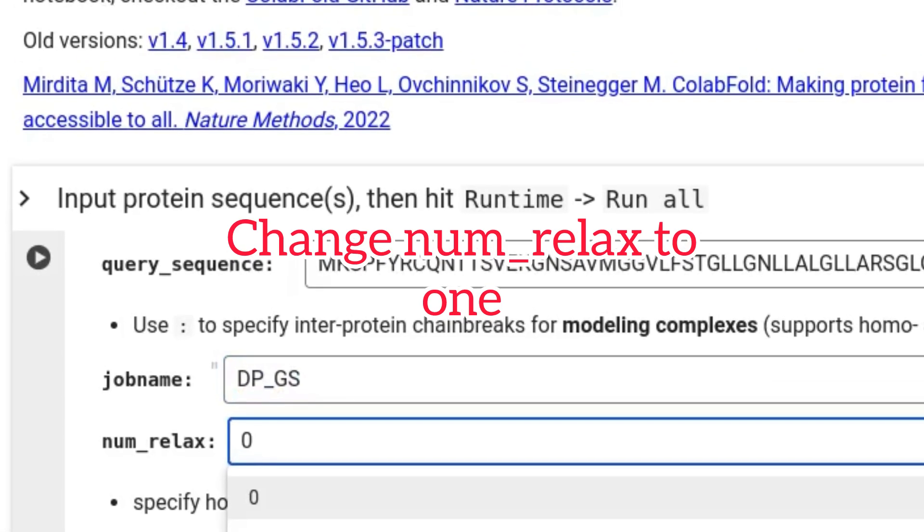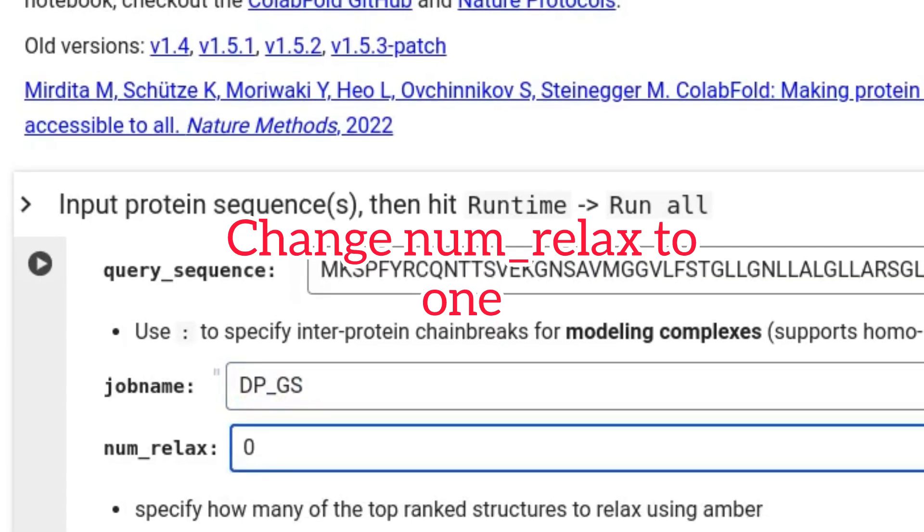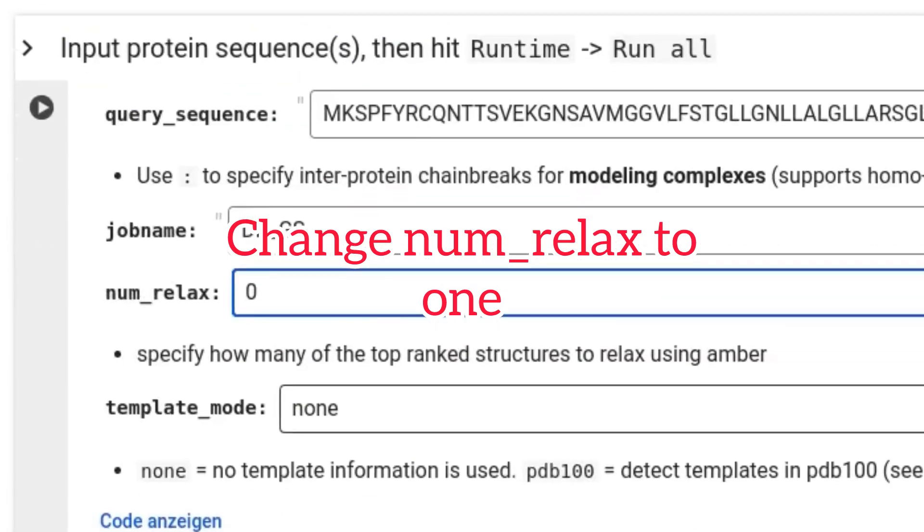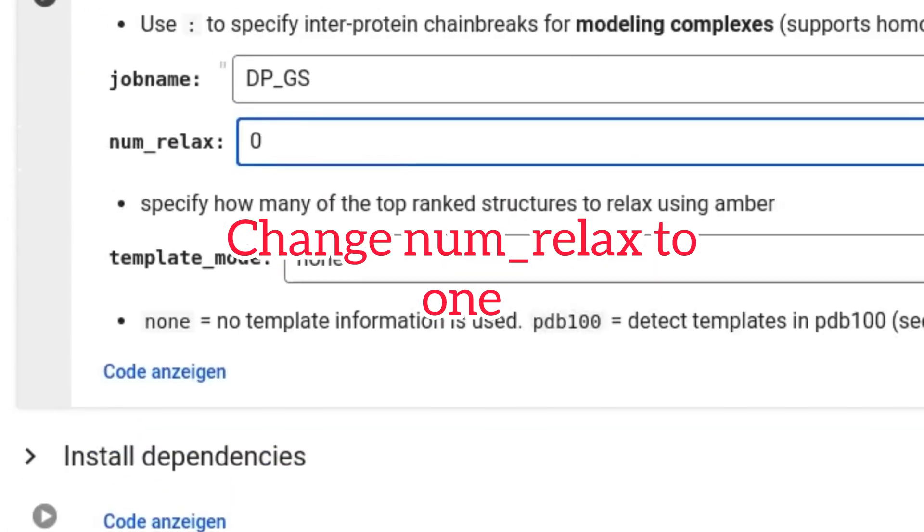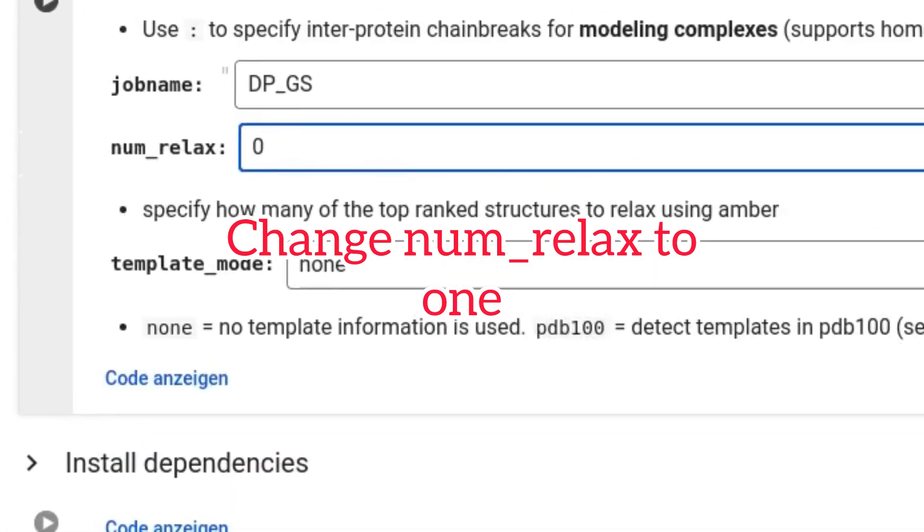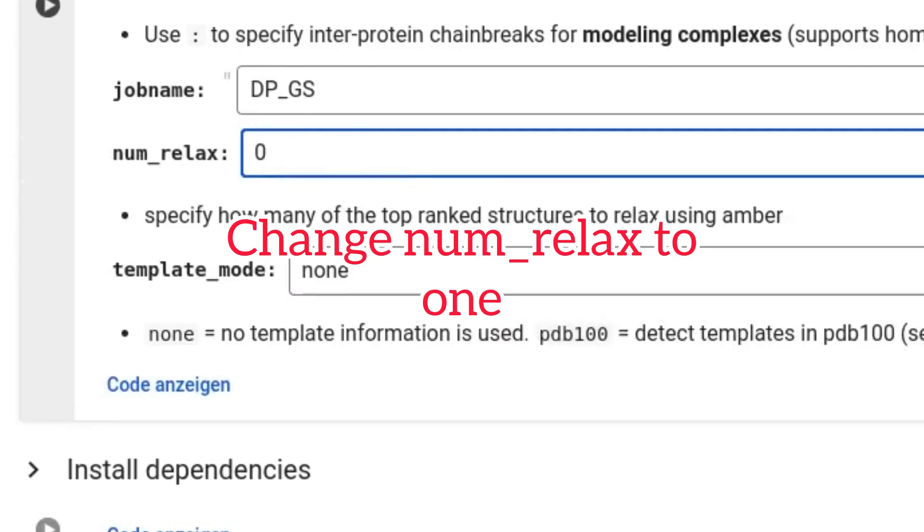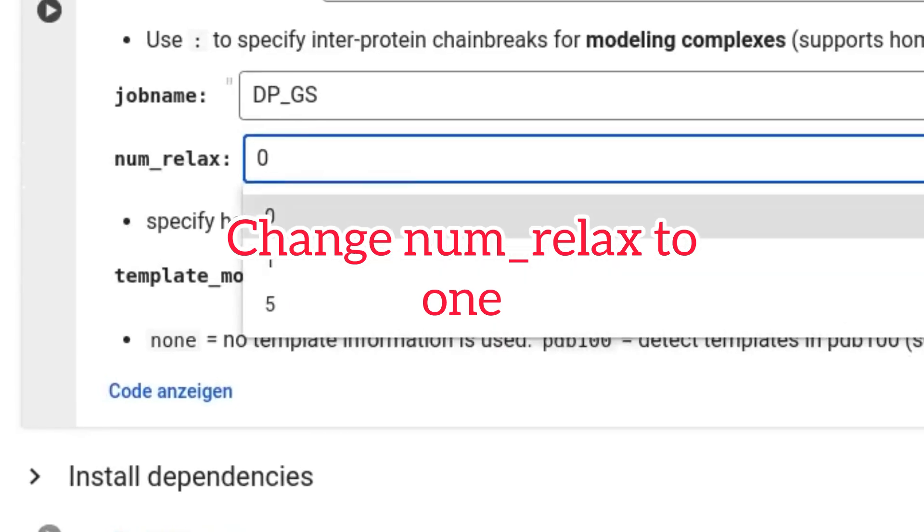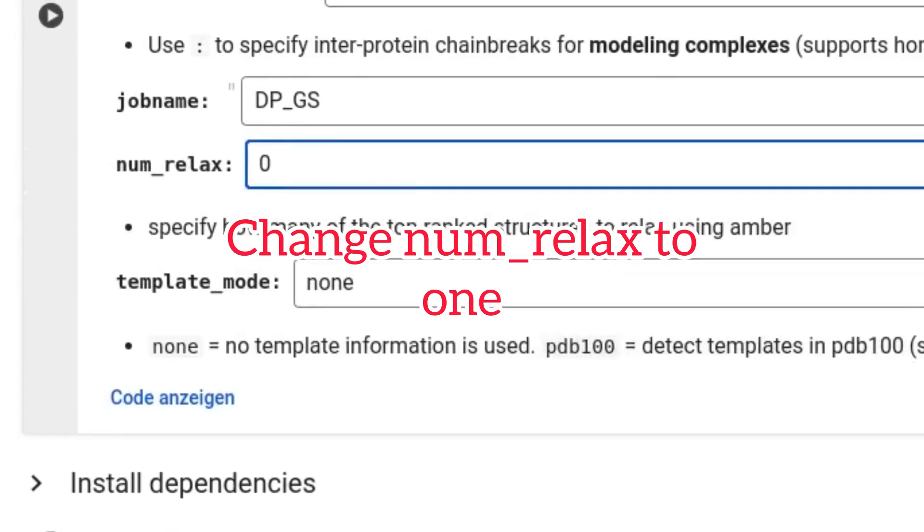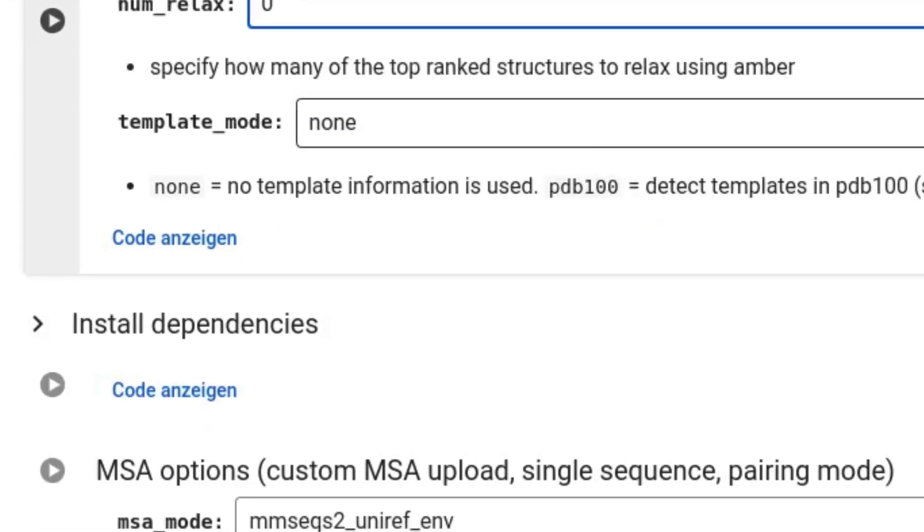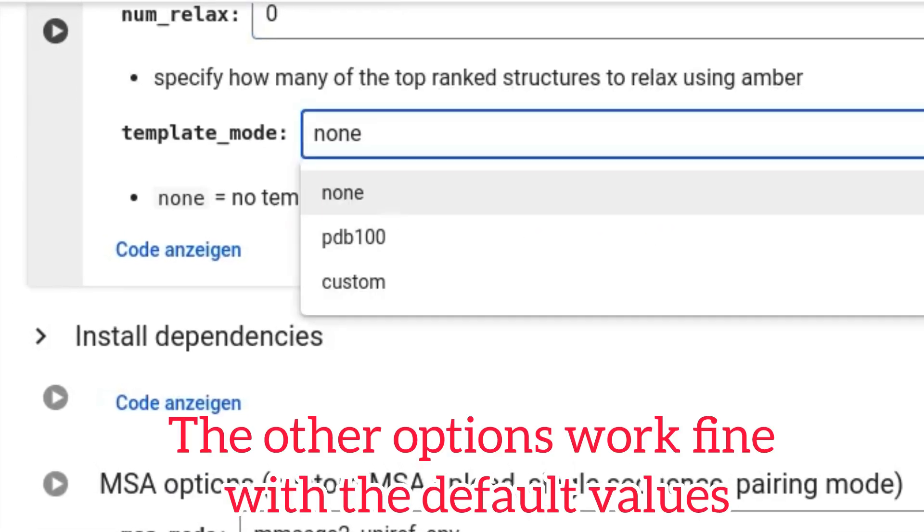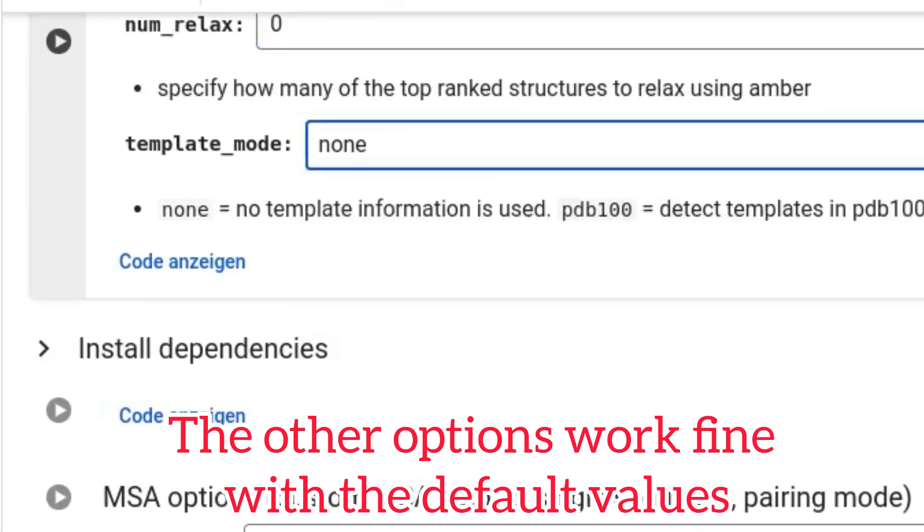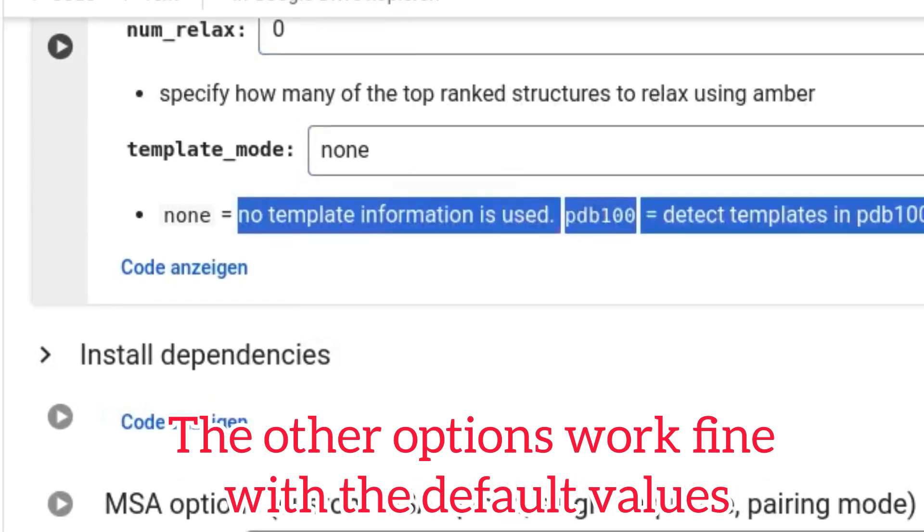Change number relax to one. The other options work fine with the default values.